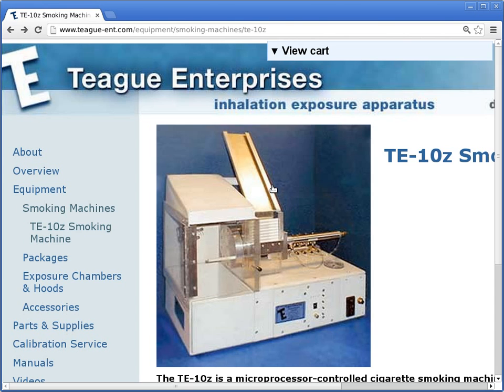So that's why you have to buy these really quite expensive lab cigarettes, load up the slide, which is the magazine. So you can actually load it up all the way up to here. And then this is a pneumatic plunger. You basically have pressurized air going in this end and also this end. So you can basically control whether you're inserting a rod into this whole thing. So you push the cigarette into the carousel. In other words, it's a wheel with holes already drilled, and you can push a cigarette into those holes, and then rotate the wheel to another hole, and then load it up again, and so on.